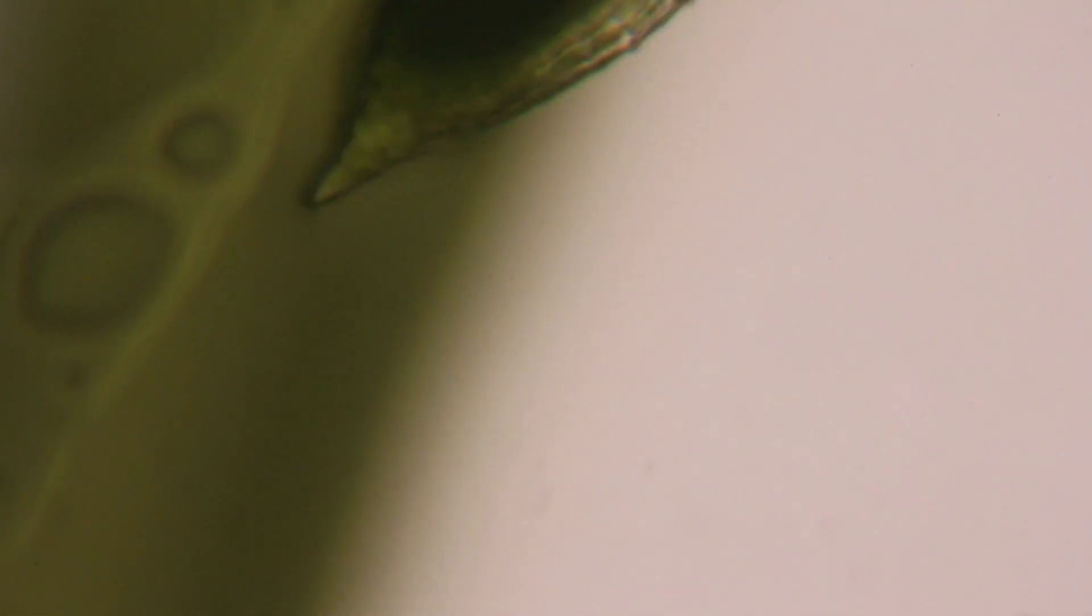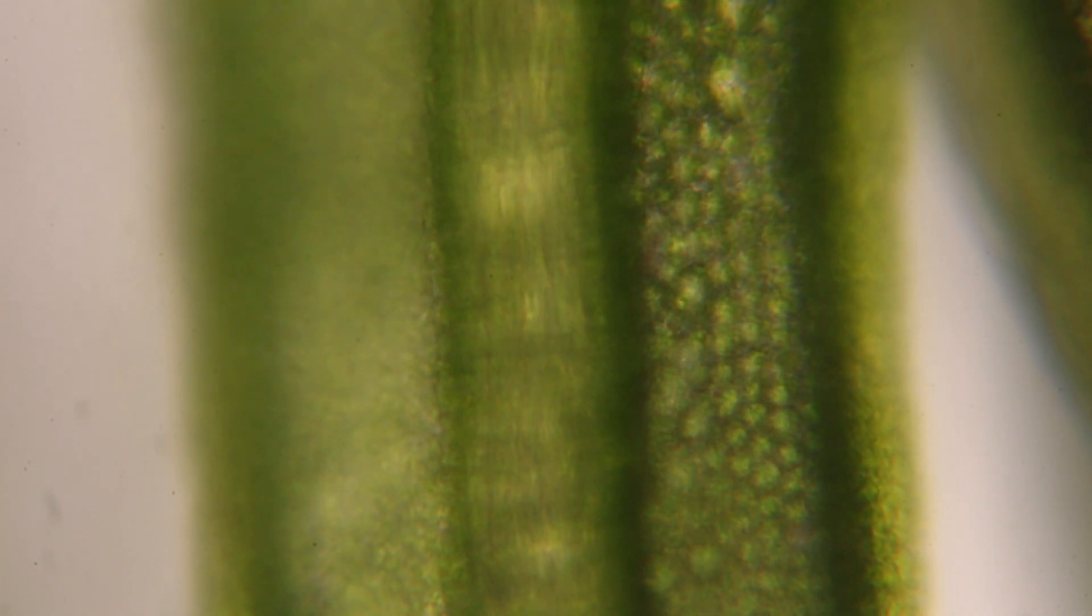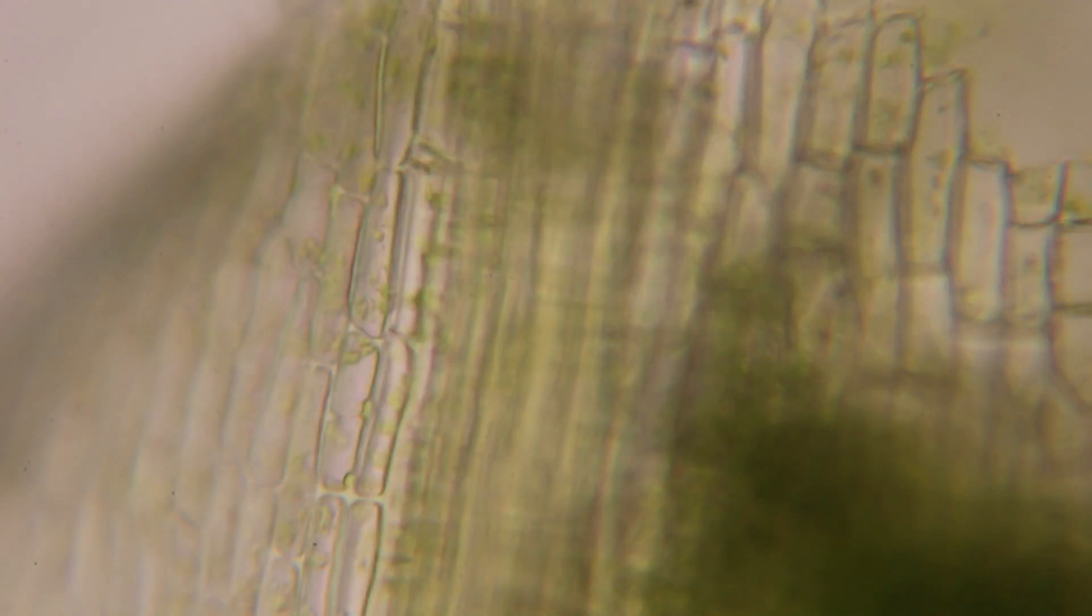Did you know that plants are green? And you probably may know this. But plants are green because the white light that the plant receives takes in all the light except for the green, which it reflects off of. And that's what you see is the green. It takes all the other white light in from the spectrum. Yeah. So the easiest to see is right at the base of the moss stem. Really cool.